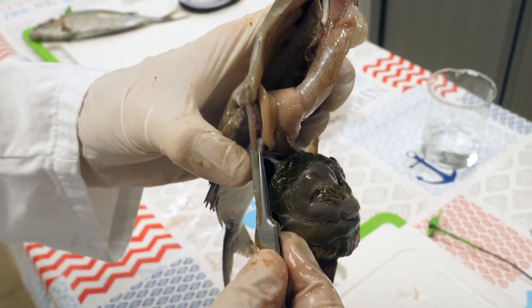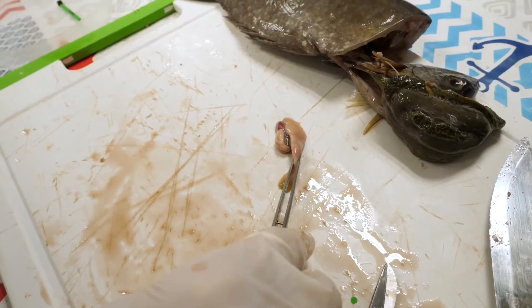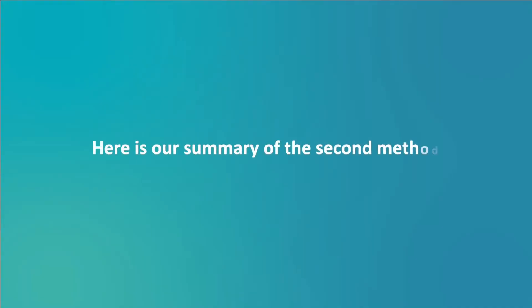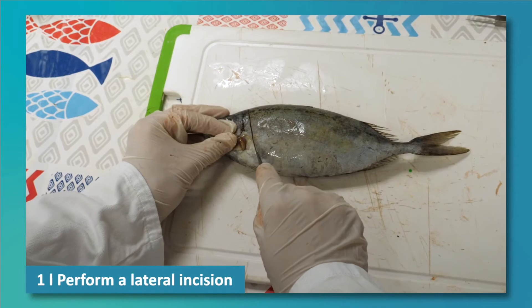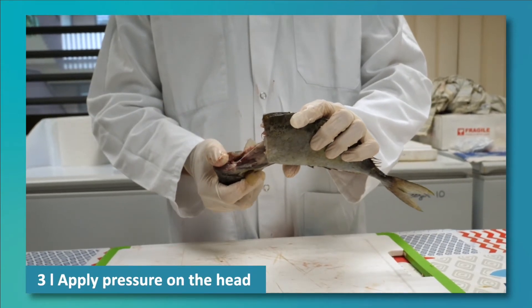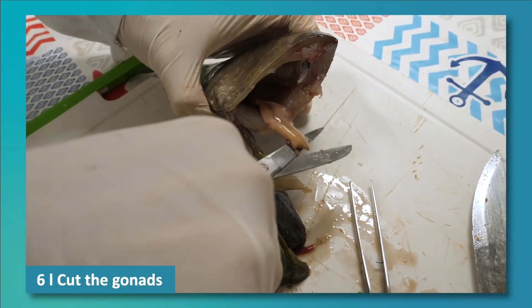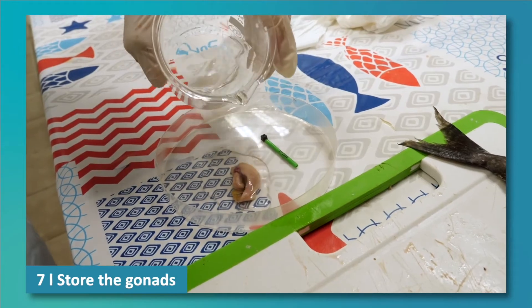Next, you can extract the gonads by cutting the tissues that connect them to the abdominal cavity. The last step is to place them in a container with an identification tag along with a little water. Here is a summary of the second method. Method 2: Perform a lateral incision on both sides of the fish. Break the spine. Apply pressure on the head to release the internal organs. Locate the gonads. Isolate the gonads. Cut the gonads as close as possible to the anus. Store the gonads in a labelled container with a little water.